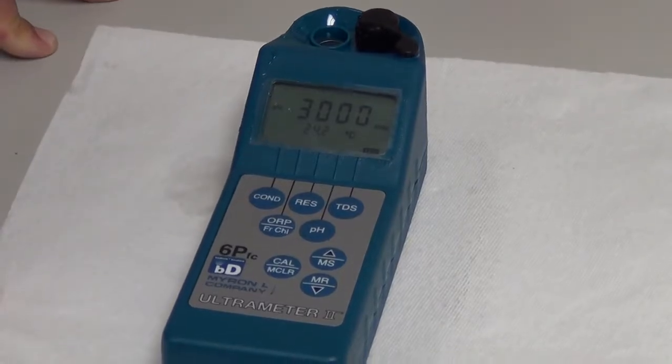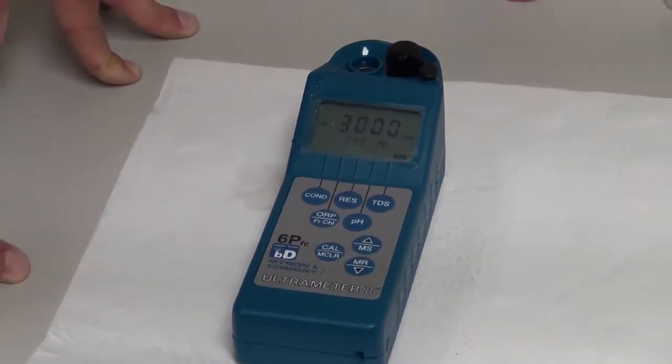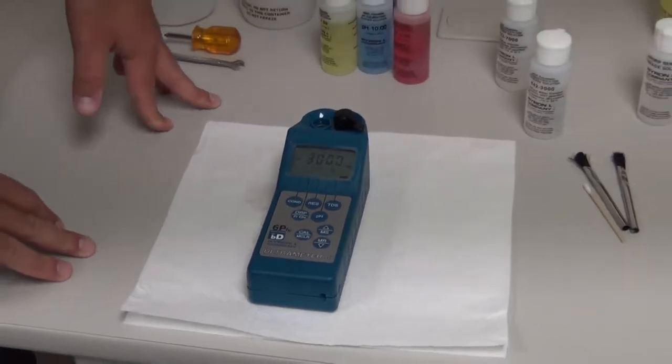We've now calibrated TDS function. Again, you want to make sure and rinse the cell cup out real good once you're done.